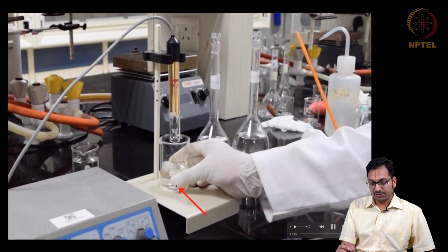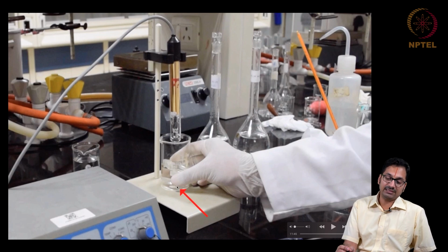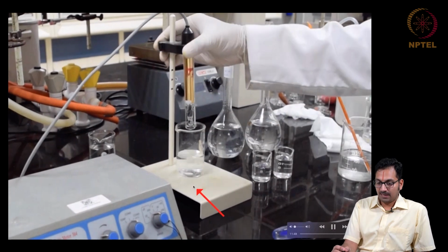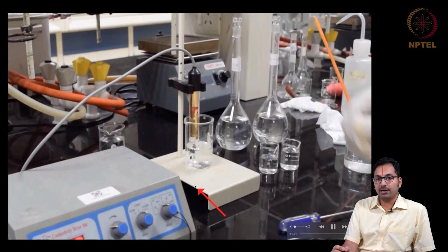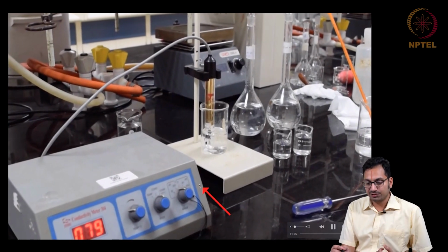stir it. Although the researcher is just using swirling as the mechanism to mix it properly, it is better done with a glass rod such that this whole solution is homogeneous. And let it equilibrate again. So it is a good idea to let it equilibrate for a few minutes so that diffusion also is complete and the whole solution is homogeneous.